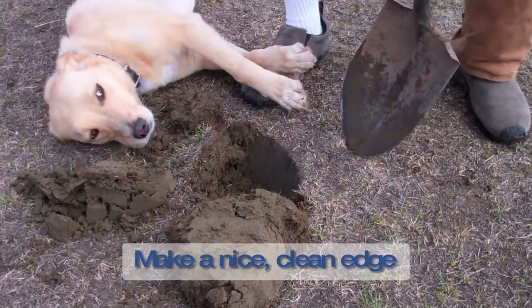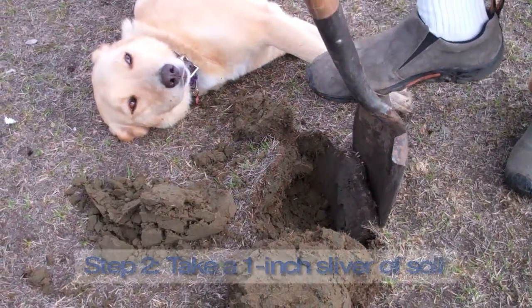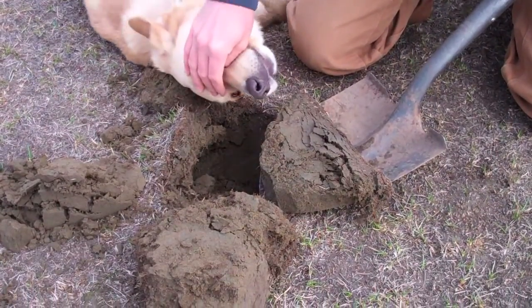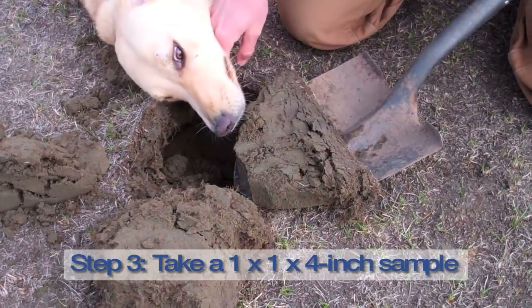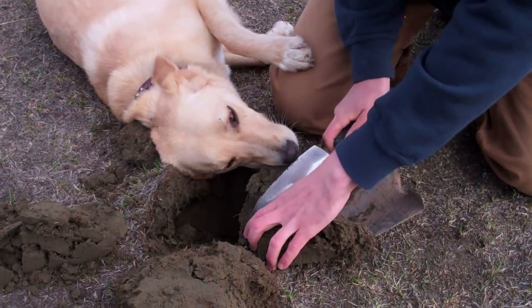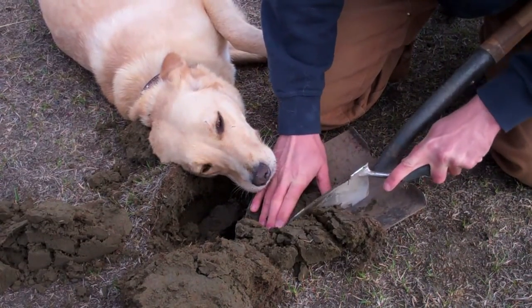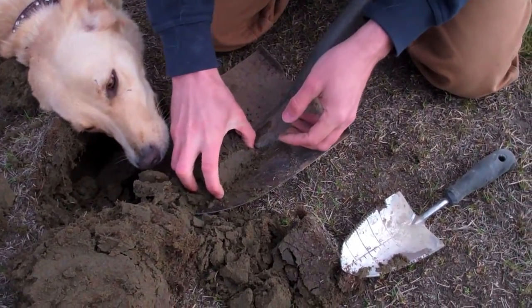So we got a nice clean edge here and I'm gonna want to take about an inch off there — we don't need that much. I'm just gonna try to take a nice sliver of soil there. Looks just like that. And then we're gonna want to take about a one-inch column right in the middle. For turf like this, we only need about the top four inches. So we'll take that and then we have a nice column of soil that should be a good subsample.